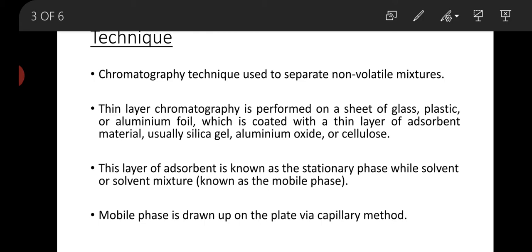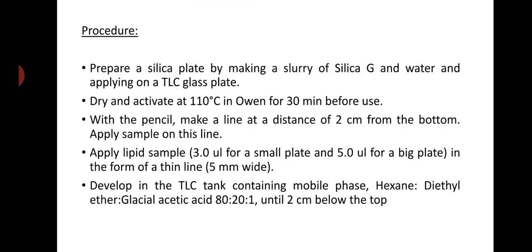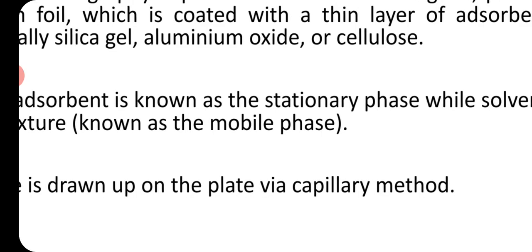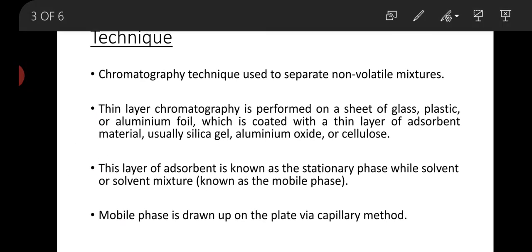How will the mobile phase move up through the stationary phase? It is through capillary action. It is written over here, last line, capillary method. So if somebody asks how the mobile phase reaches into the stationary phase, it is through capillary action.